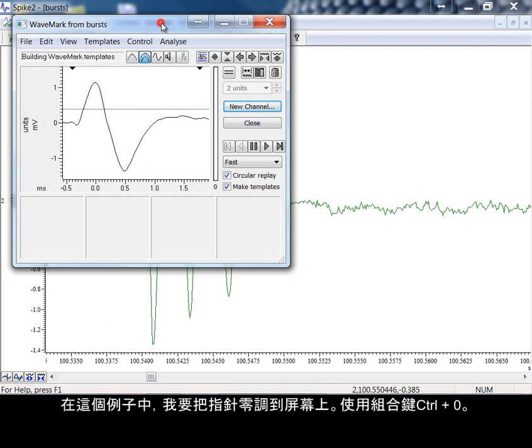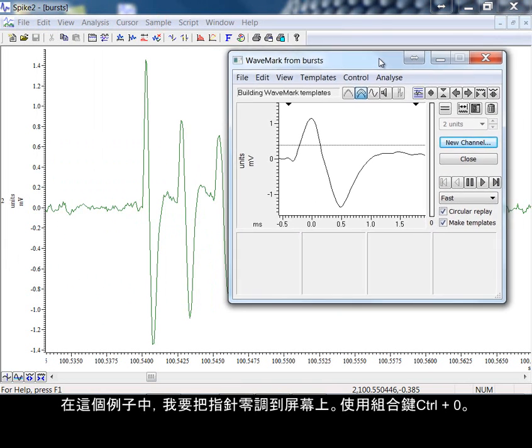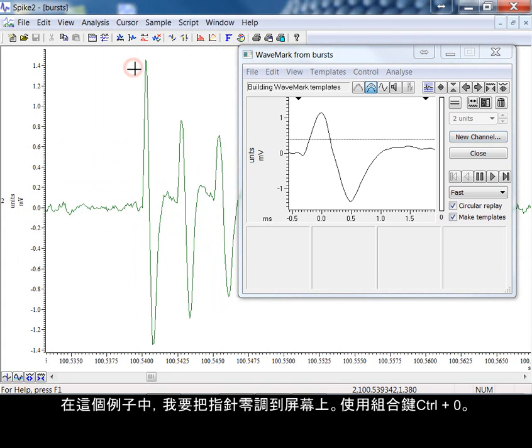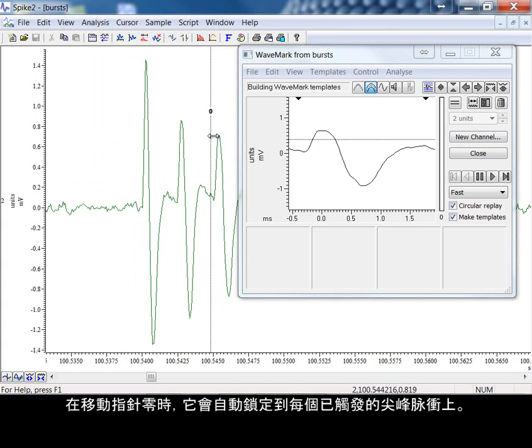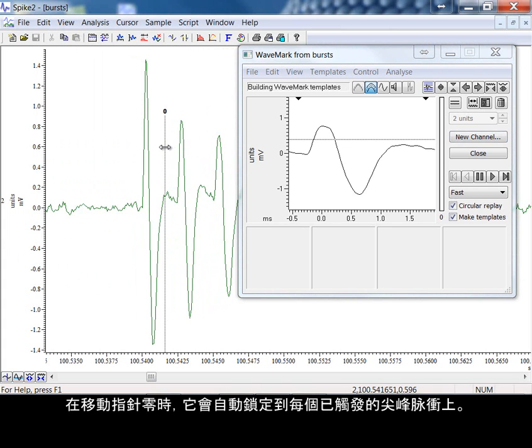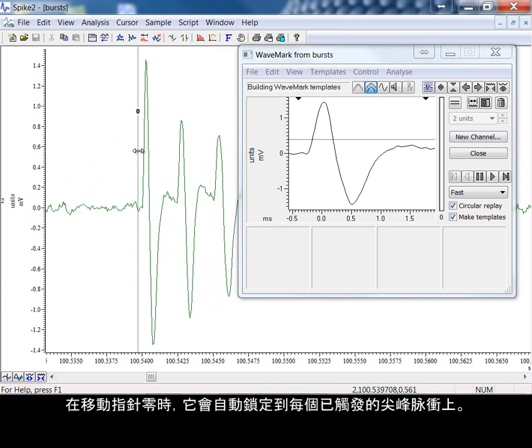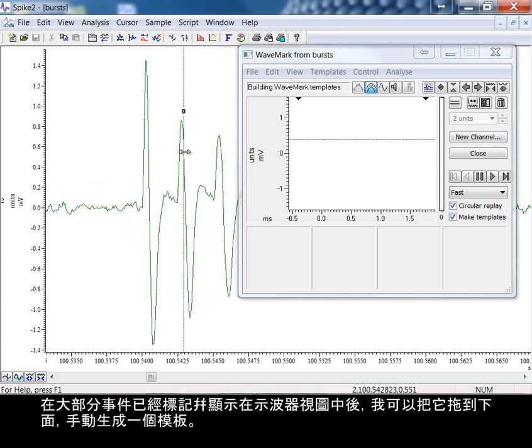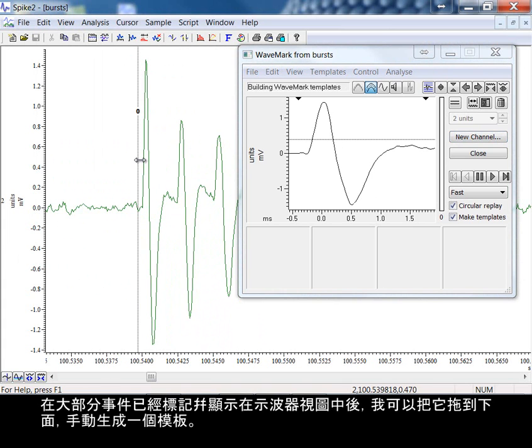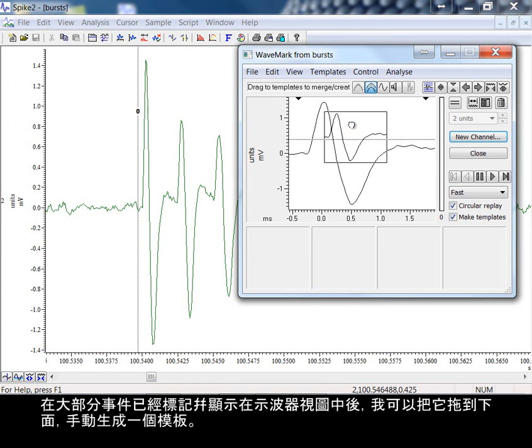In this example, I'm going to call cursor 0 to the screen. I do this with control and 0. As I move cursor 0, it latches automatically to each of the triggered spikes. With the largest of these events marked and shown in the oscilloscope view, I can drag it down to form a template manually.